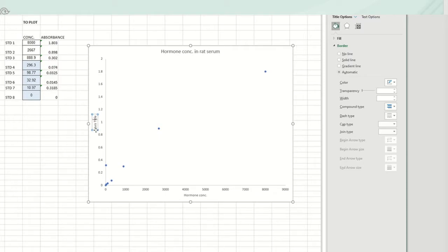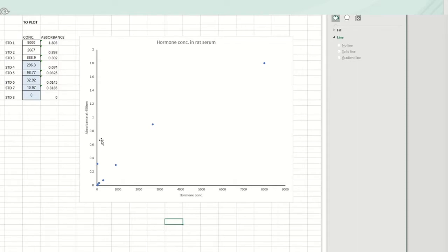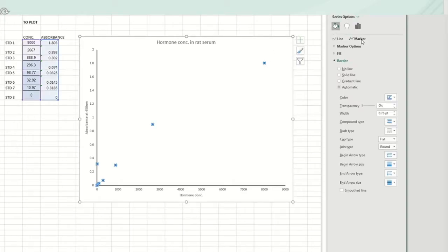And what you can do is just select the x-axis, and we're just going to make the line thickness a little bit stronger, so it's easier to see what the axis is. So I do the same on the y-axis. I just change it so that the line thickness is also bolder. So I go to about 1.5, and there you have it. You can clearly see the frame for my plot, and you can see my points here. We can change the point. I might change the point series to make it a different color, so if you come here, you'll be able to go to the line, to the marker, and change that to maybe red to stand out.